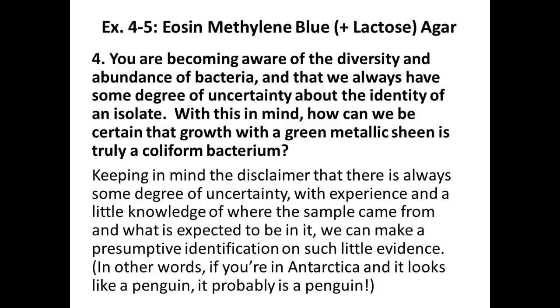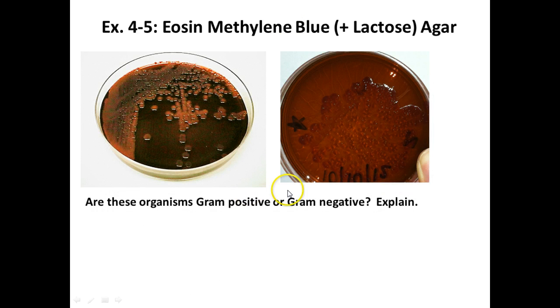And so in the case of our lab, if it looks like E. coli, it probably is E. coli, right? And unfortunately, our one student who has E. coli, it didn't come out as it's supposed to look. So I think we got some contamination there. So we'll have to redo that one.